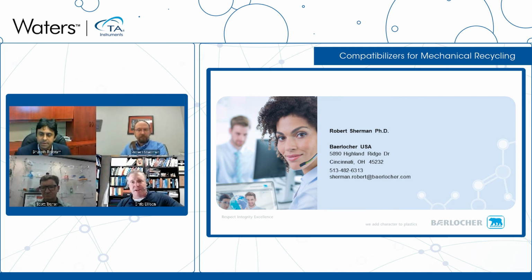Yeah, so the NMR was done with deuterated tetrachloroethane at elevated temperature. You can find that information in the supporting information of our ACS Applied Materials paper, I think from 2020, which covers how we did all that characterization. The SEC of the precursors, before you connect the blocks together, can be done nicely with high-temperature SEC for the polyolefin and with HFIP SEC for the polyester. Those can be done with Waters instruments and many other instruments with light scattering detection.